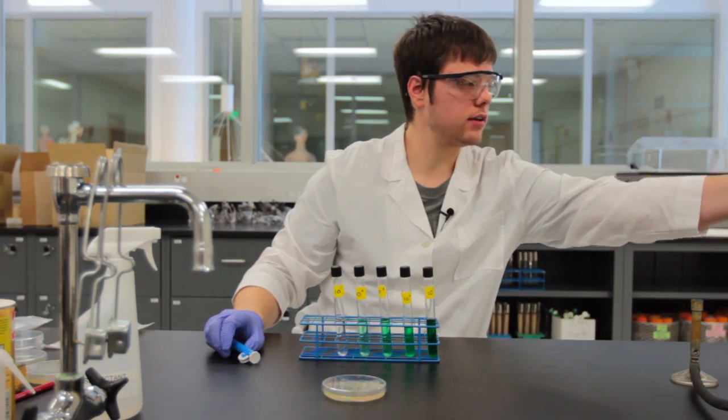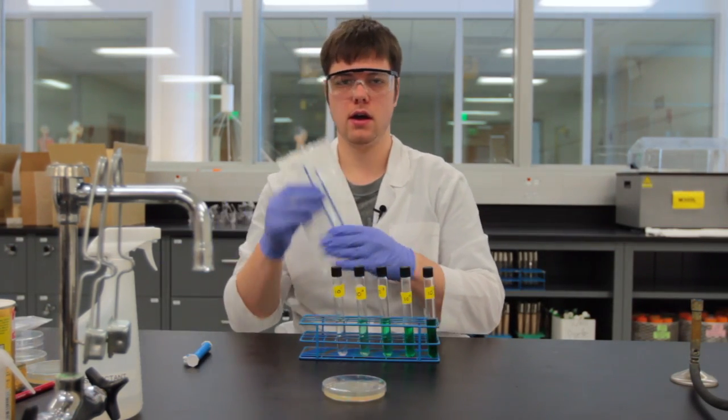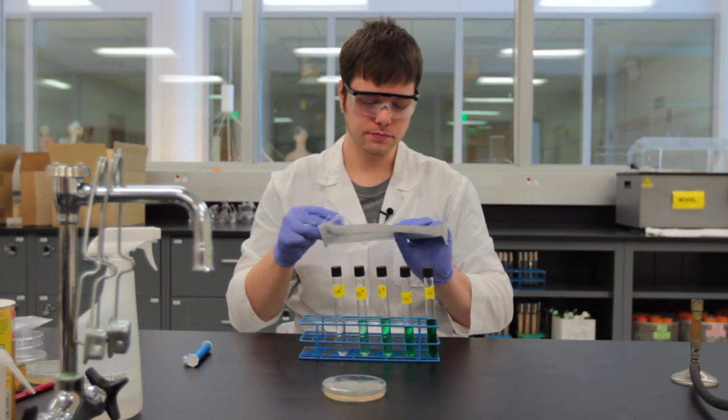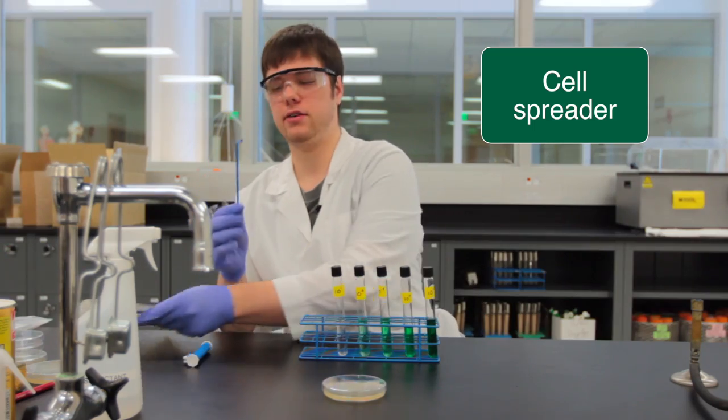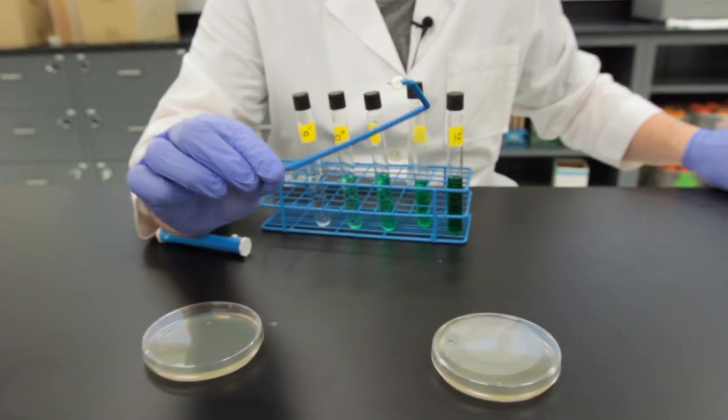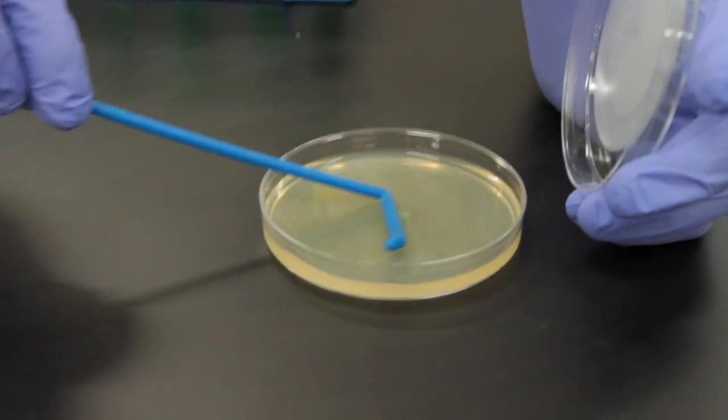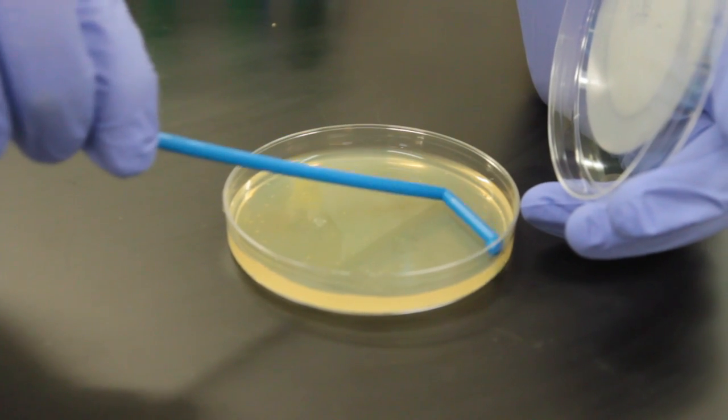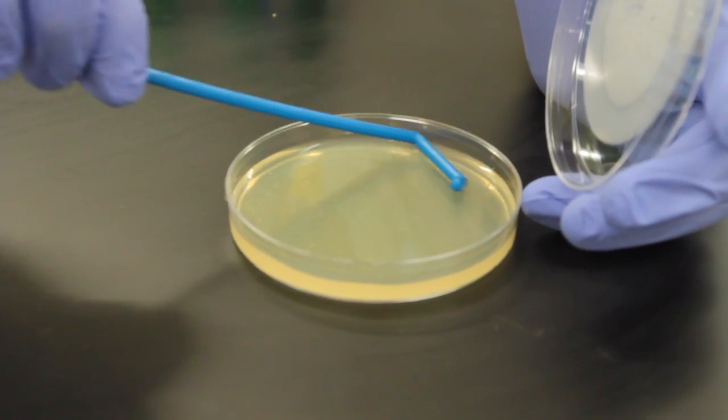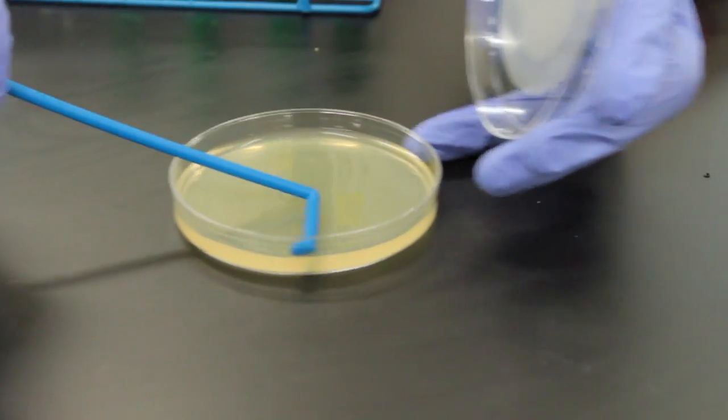I then need to grab a spreader, or affectionately known as a hockey stick. The spreader we're going to use by applying pressure to the agar as well as where our bacteria was dispensed. Notice how although I'm applying pressure, it's gentle enough that I am not destroying the nutrient agar.